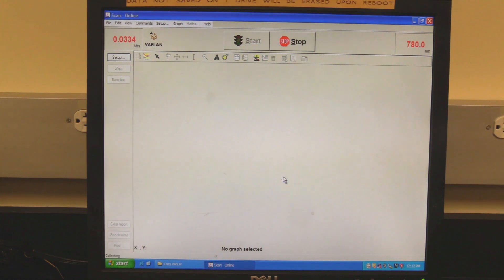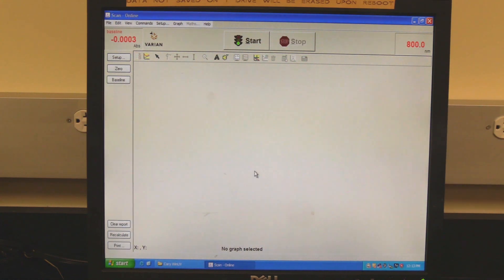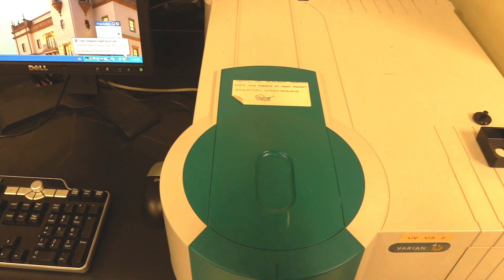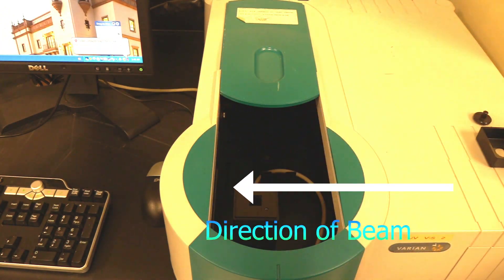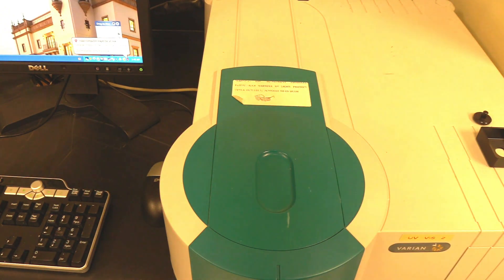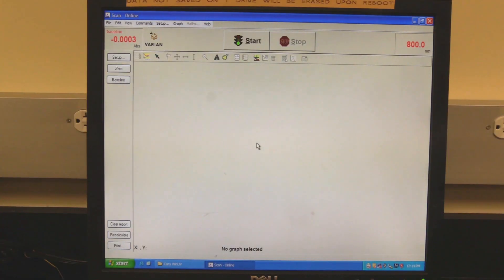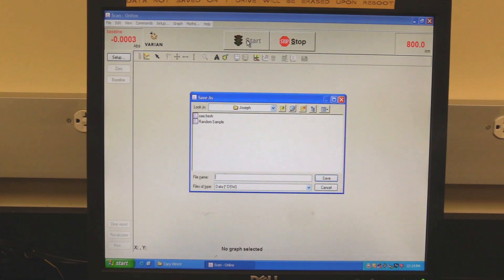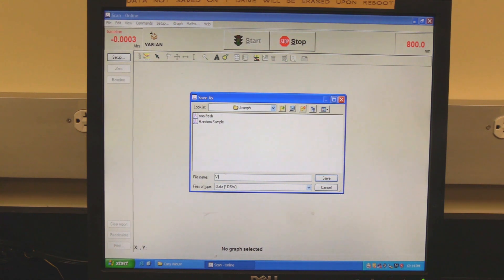Click on OK to make the baseline measurement. Wait for the measurement to finish. Slide open the sample chamber lid, replace the blank cuvette with the sample cuvette, and close the lid. Click on the start button. If save at start was selected, then the software will prompt the operator to save, as shown in the video. Find the appropriate folder, name the file, and click on save.